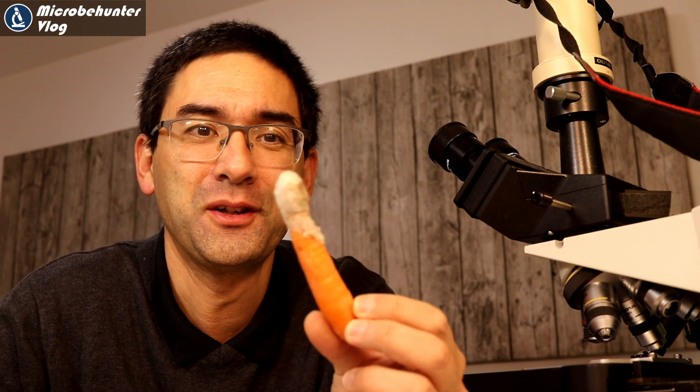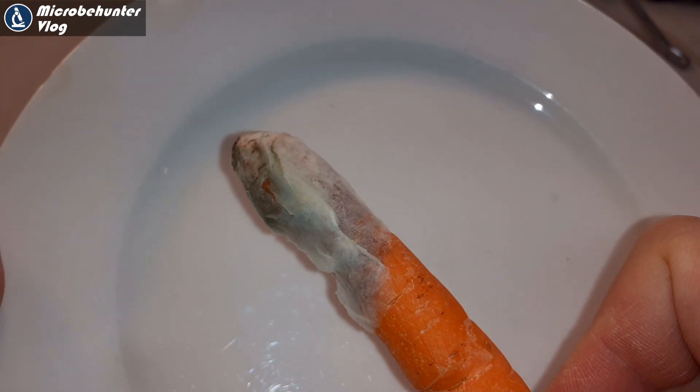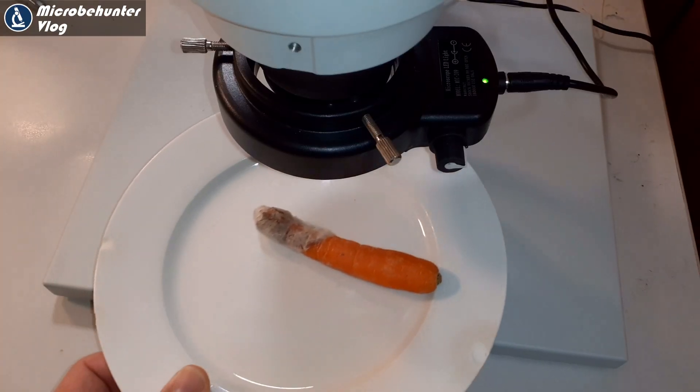Hi, Microbe Hunter here. My refrigerator is a great source for microscopic specimens. Look at this carrot — it's totally moldy and I think it's a really great specimen to put under the microscope.